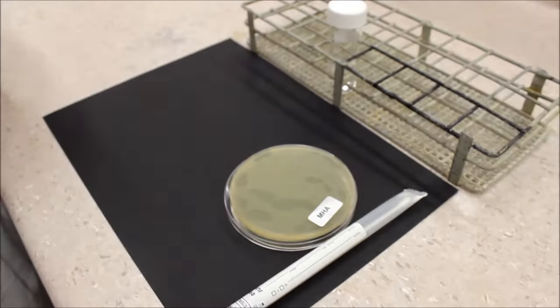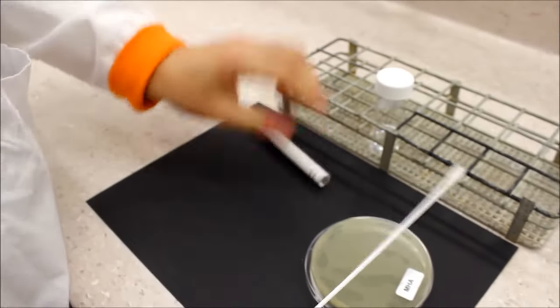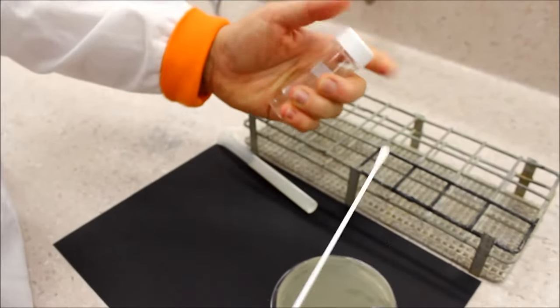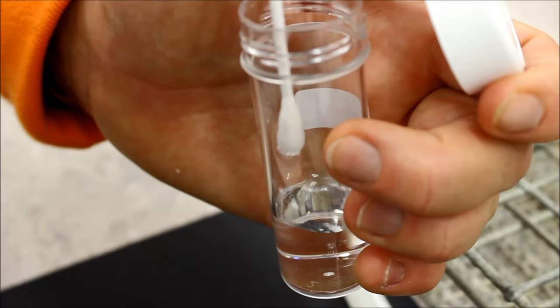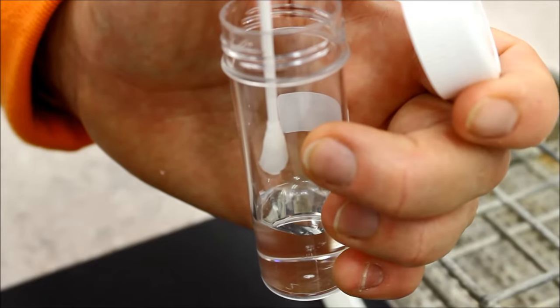Swabbing a plate. Soak a sterile swab in the suspension and press against the inner wall of the saline tube to remove excess fluid.